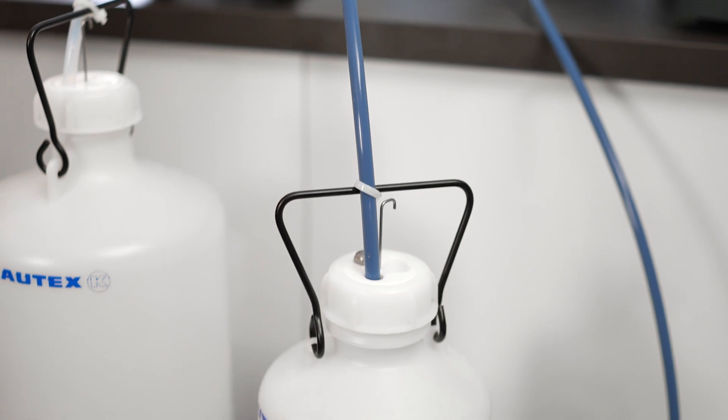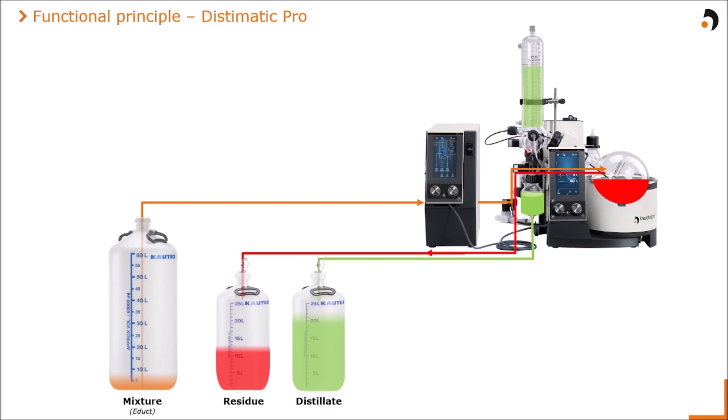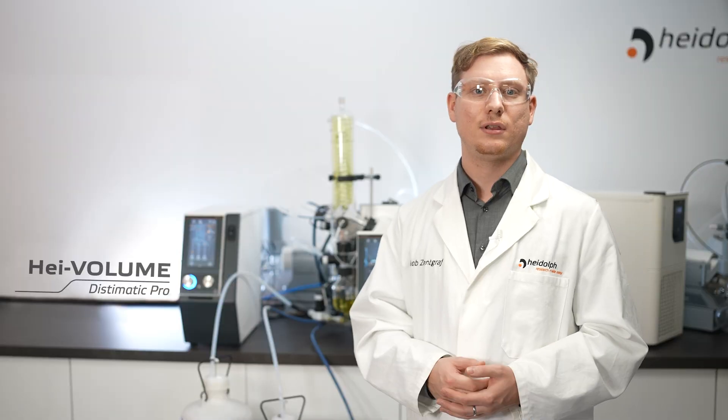Afterwards the system refills the evaporation flask with fresh mixture and starts the entire process again until the mixture vessel is completely processed and the liquids are separated. The big benefit is that no manual interaction is necessary to process even several liters of mixtures.